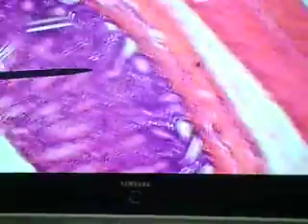Okay, beautiful. There is the slide of the rectum, and what do we notice? That the outer longitudinal layer is what? Uniform in thickness. Right? So there's a uniformity in the thickness of the outer longitudinal layer. Okay? Right here, for some strange reason, the circular muscle is getting a bit thick in this region, and there is quite a bit of autonomic tissue right here. So the auerbach plexus, I don't know exactly what happened, but there is quite a little thickening here of the circular layer.